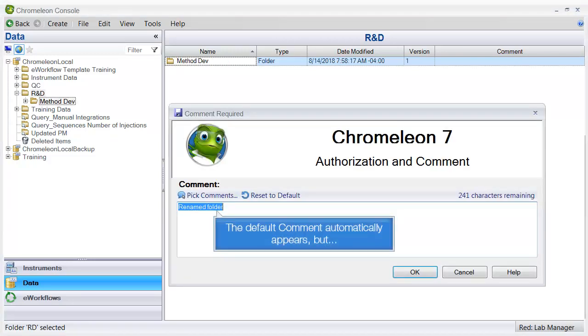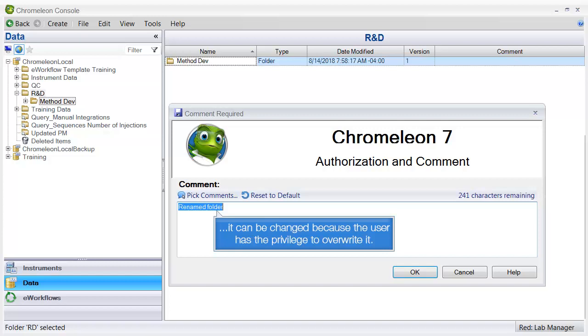The default comment automatically appears, but it can be changed because the user has the privilege to overwrite it.